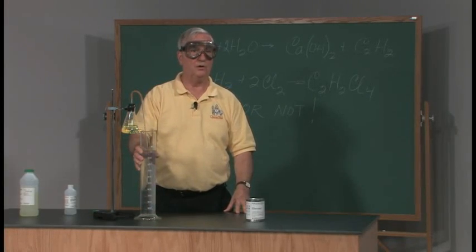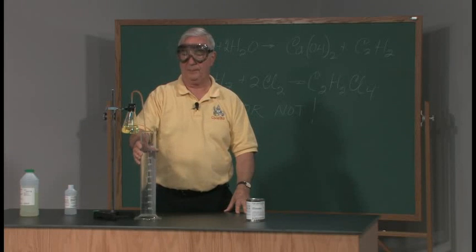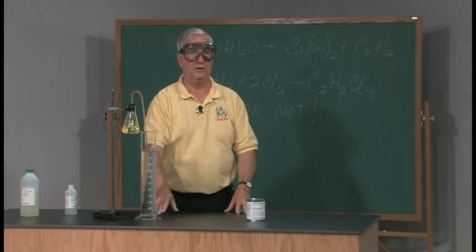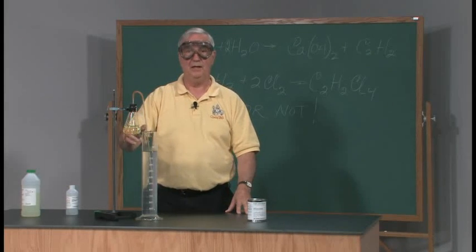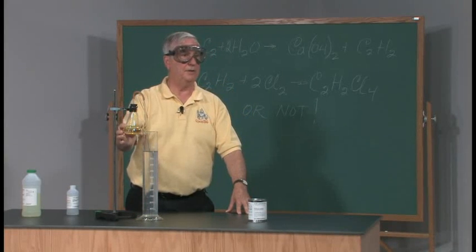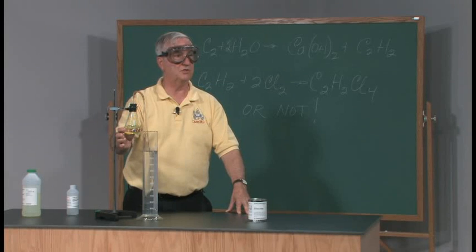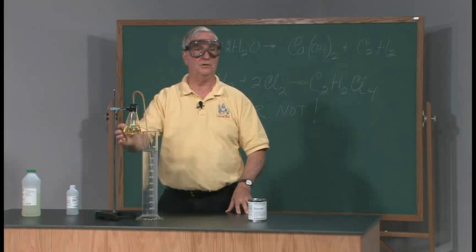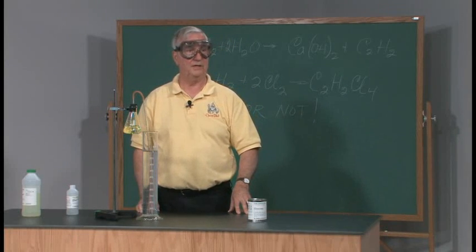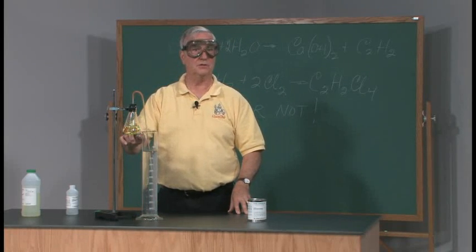Much the same as you get carbon residue when you burn any hydrocarbon material. So, underwater fireworks or micro generation, small scale generation of acetylene and chlorine gas. If nothing more, this will probably be the first time your students would ever have seen actual chlorine gas. And that's a favorite question on many standard exams, what color is chlorine gas? And there it is. Thank you.